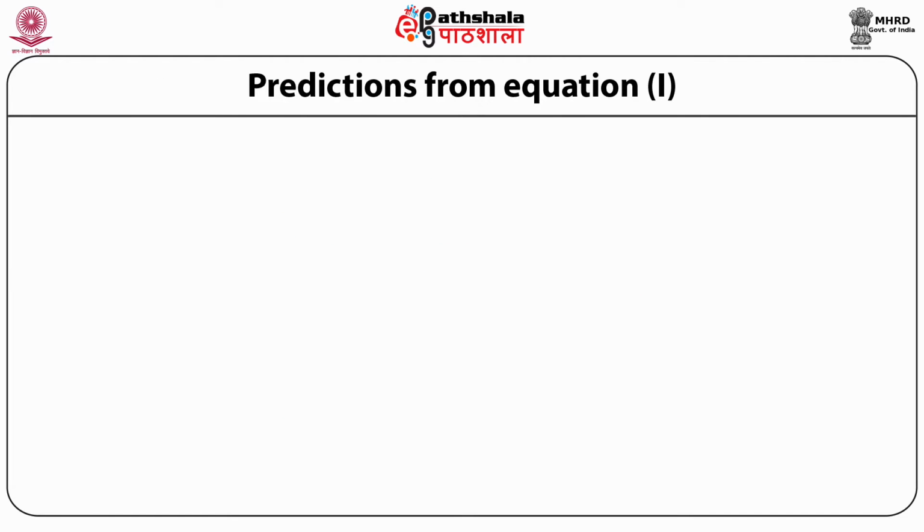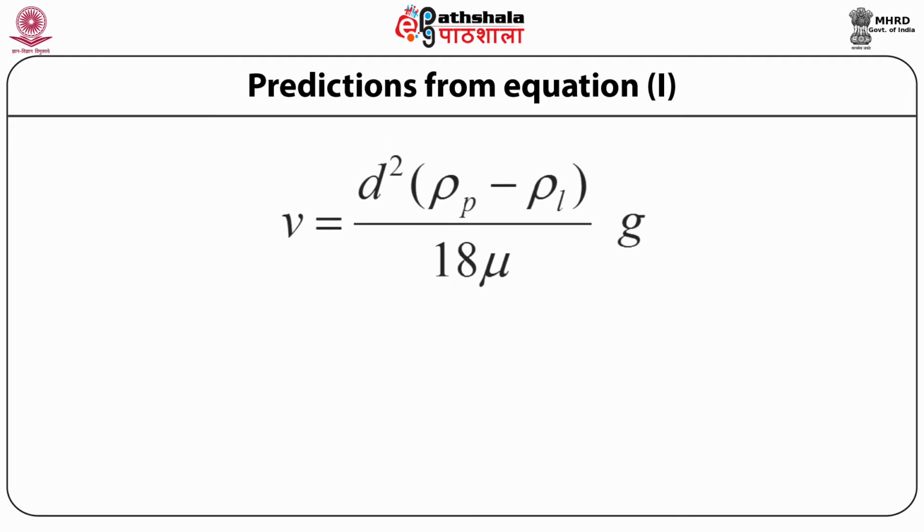The molecules are separated in density gradient centrifugation, as you are aware from the Stokes equation, that the velocity of the molecule depends upon the difference in the density of the medium, like the density of the particle and the density of the medium. So that difference is an essential factor to separate out the molecules.